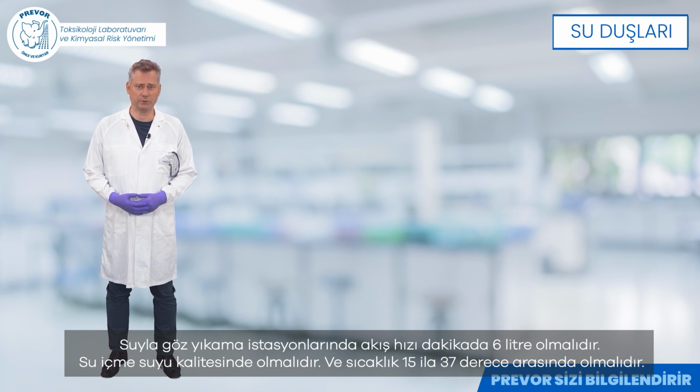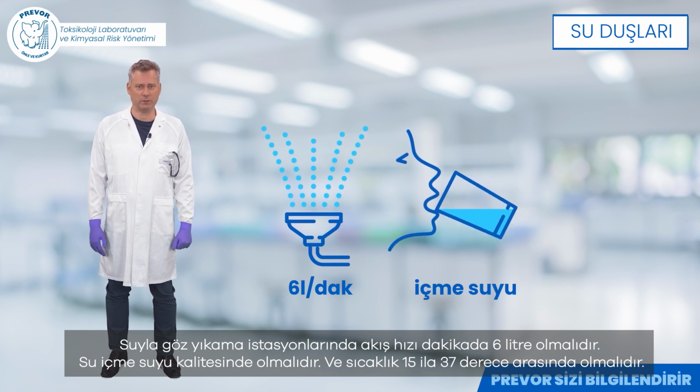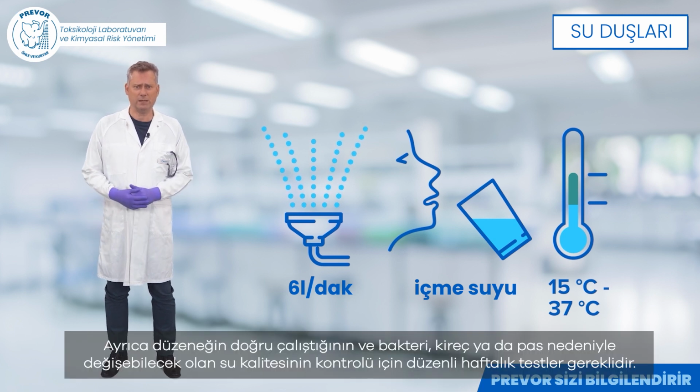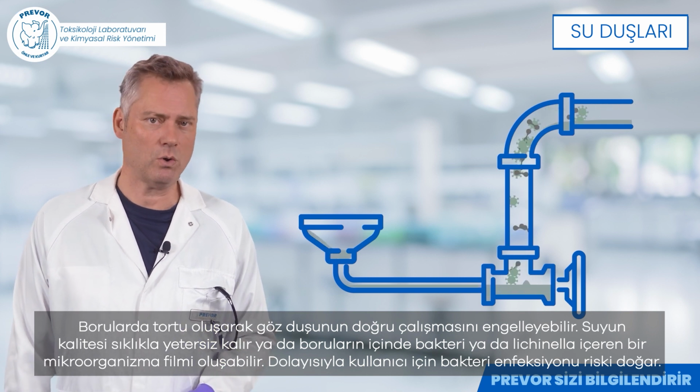Water eye wash solutions should have a flow rate of 6 liters of water per minute. The water quality should be that of drinking water, and the temperature should be between 15 degrees and 37 degrees. In addition, weekly regular tests are necessary to check the correct functioning of the installation and the quality of the water, which could suffer from the presence of bacteria, lime or rust. Deposits can form in the piping and prevent the proper functioning of the eye wash.